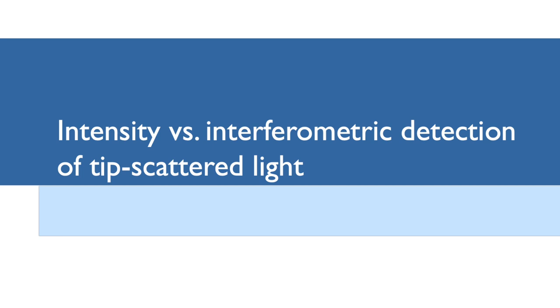Okay, so far we talked about fields. I didn't talk about any detector signal. What I was analyzing so far, at least in the schematics, were fields. What I showed you here were detector signals. But now we need to see a little bit what we are actually measuring.